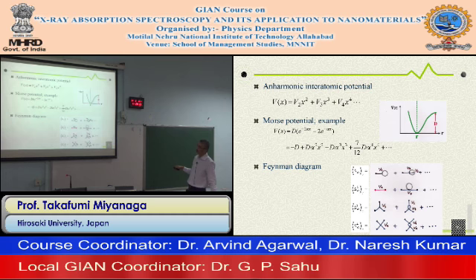In the harmonic part, the second order cumulant has this V2, which comes from the harmonic coefficient of the potential. And this second order cumulant also includes the fourth order coefficient from the potentials.